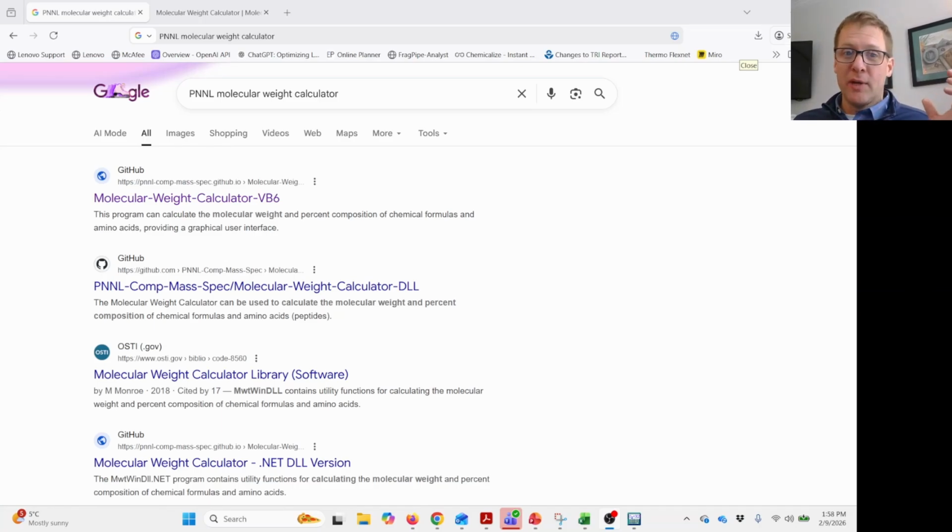It's got this great little hidden tool in there called the Capillary Flow Calculator that helps you do things like calculate the optimal flow rate, or calculate the expected pressure that a column may see for a method you may be translating. So I thought we would give a couple of little examples of this super useful tool that a lot of people don't know about.